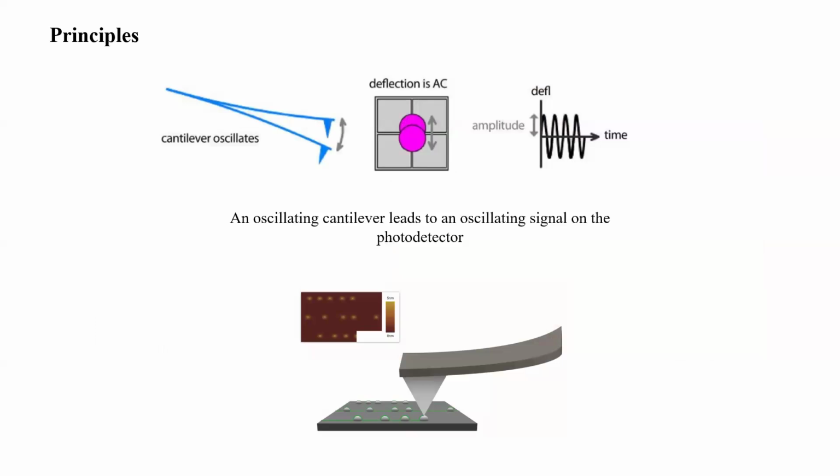Okay, so in order to characterize a sample, it scans the sample surface using a sharp tip. The tip has to be sharp to measure high lateral resolution for a topographic image. The tip is attached to a cantilever, which is then attached to a probe or chip, which is not shown here actually. The cantilever is oscillated near its fundamental oscillation frequency by a piezoelectric actuator in response to the voltage applied. SHO predicts the motion of the cantilever.